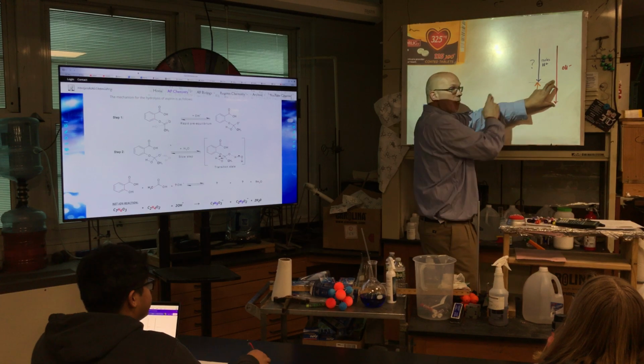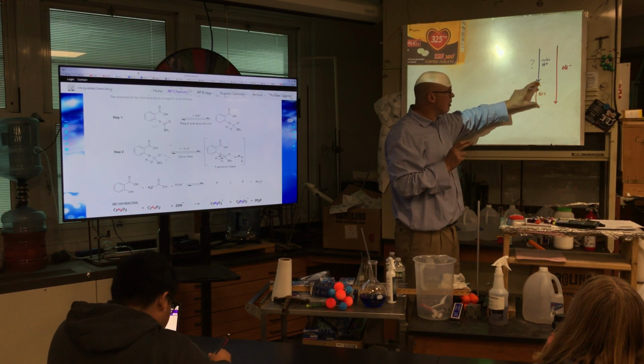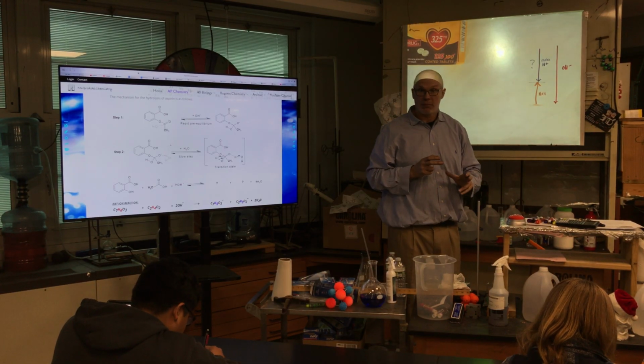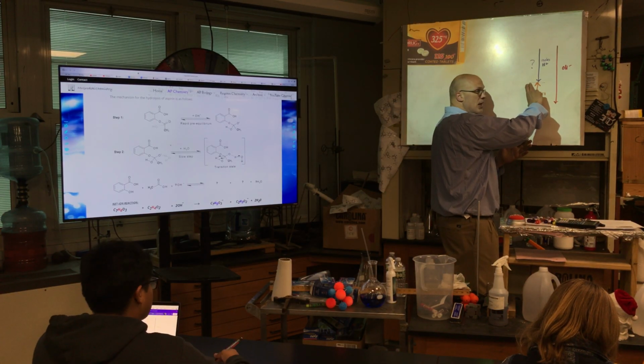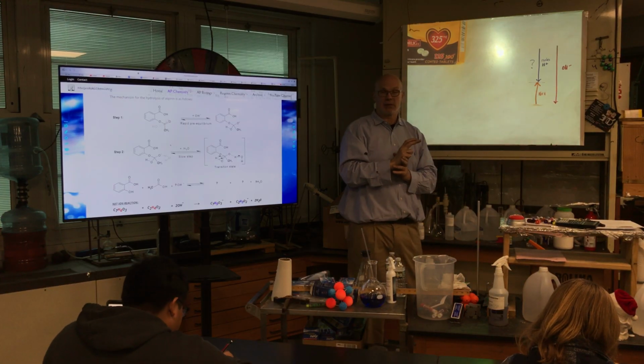How do we get this arrow? We subtract the excess moles of hydroxide from the total. I can't say enough today: once we know the moles of HCl, we know exactly the moles of excess hydroxide.